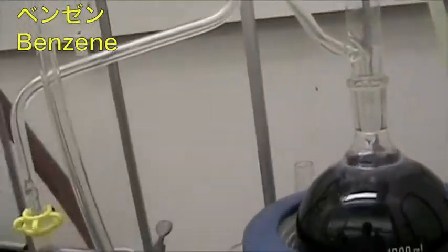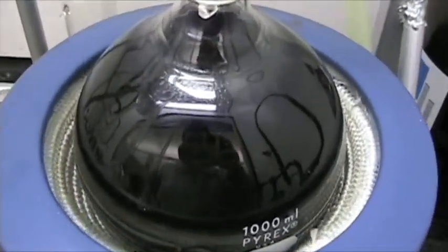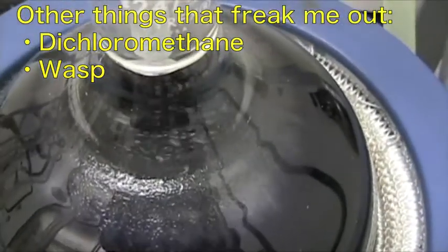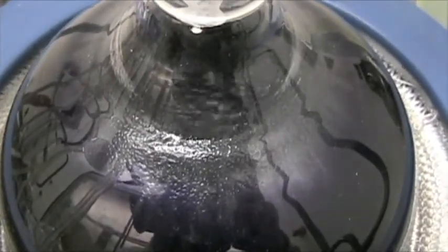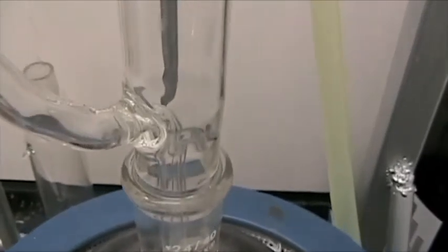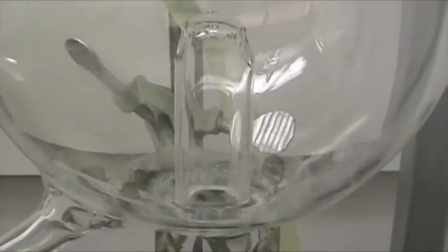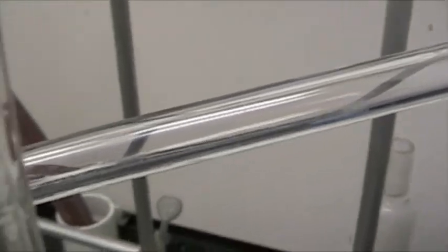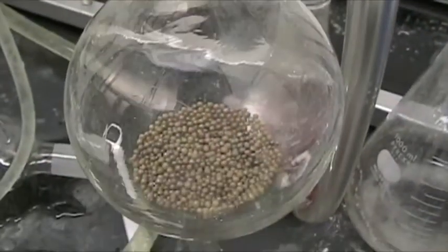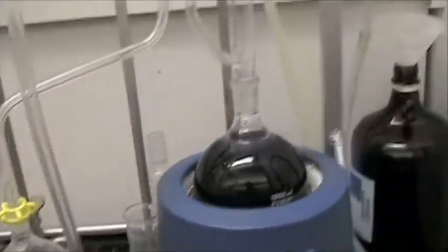Over here we have a benzene still. One of the people in our group needs benzene, and this still, which I actually maintain, it freaks me out. Benzene is one of the few things that actually scares me. The blue-violet color is caused by an indicator of dryness — so as long as it's dark blue like that, I know it's dry. When I have it turned up high enough, the gas will come up into this bowl, come out that outlet, and condense inside the bowl. There's also a condenser above. Then it comes down and has two ways to go — either back to the flask, or over here to this collection flask. This is just a placeholder to keep the outlet clean. That's how the benzene still looks, and it scares me. I hate benzene.